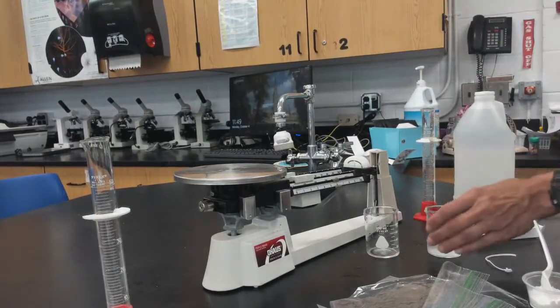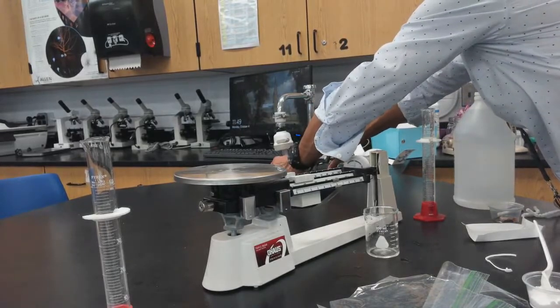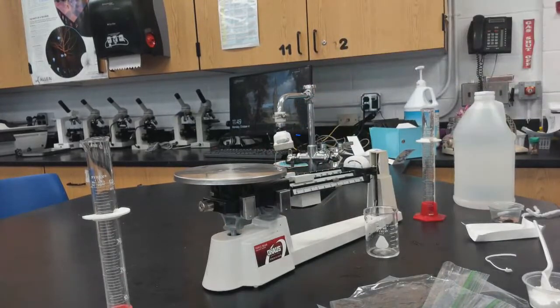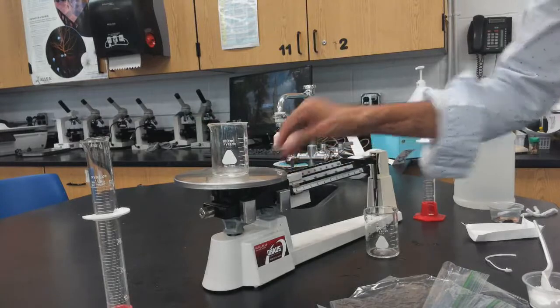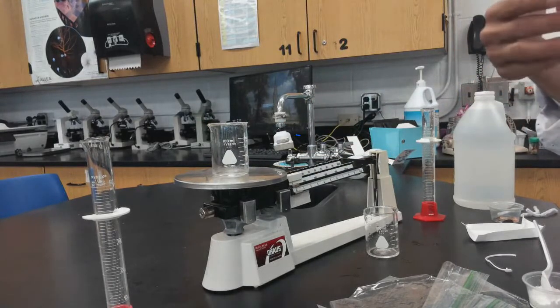Rinse out your beakers, clean and dry them, then start the next trial.